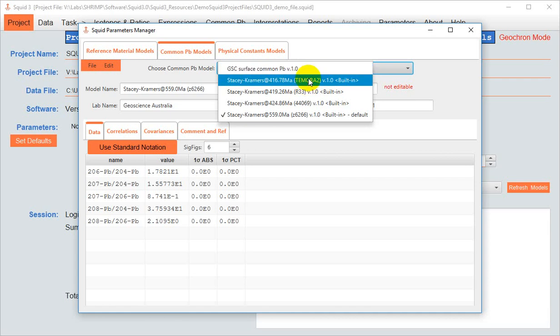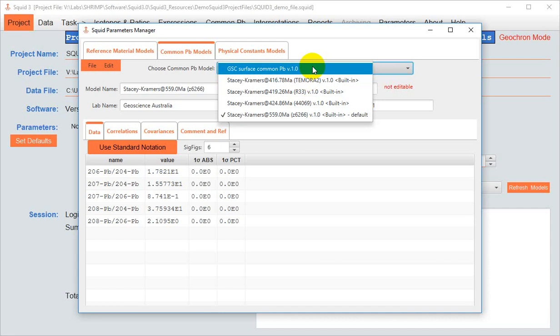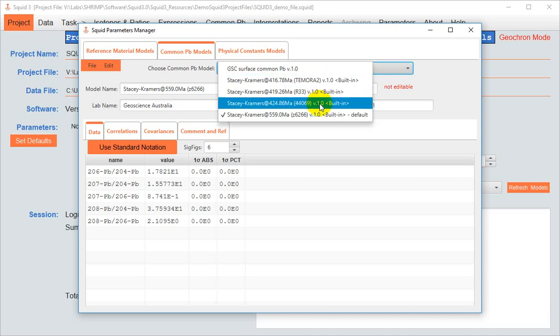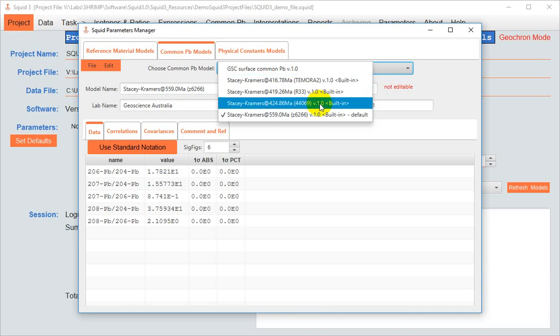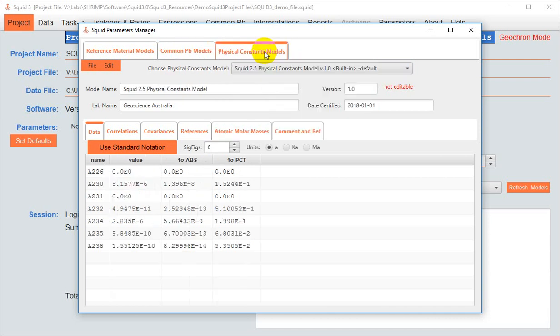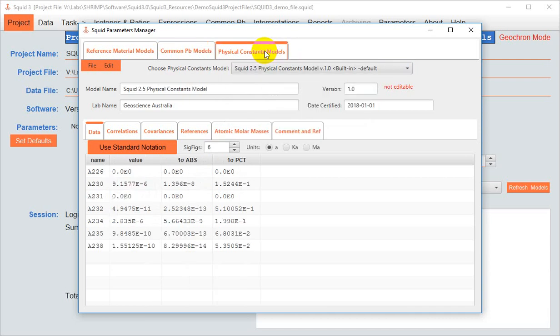For example, at the GSC, we measured the common lead composition of our gold coat, and we often use that for the common lead correction of our unknowns. Regardless of the intended use, fixed common lead compositions can get a model.